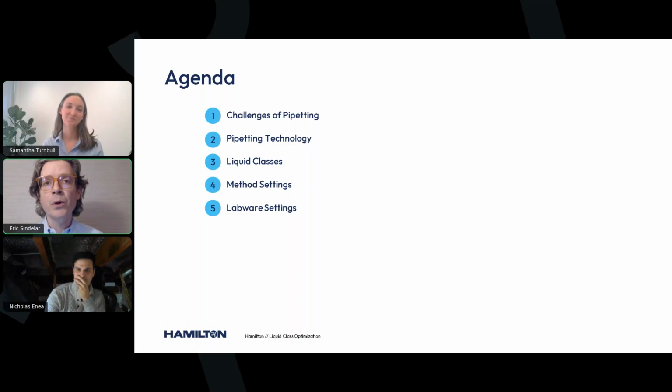So for the Hamilton portion of this presentation, I wanted to cover a few different topics. First, talk about the challenges in regards to pipetting, how we account for that from a technology perspective, and then dive a bit deeper into liquid classes, before I hand it over to my colleague Samantha Turnbull to cover method settings and labware settings that play a role in facilitating proper liquid handling.